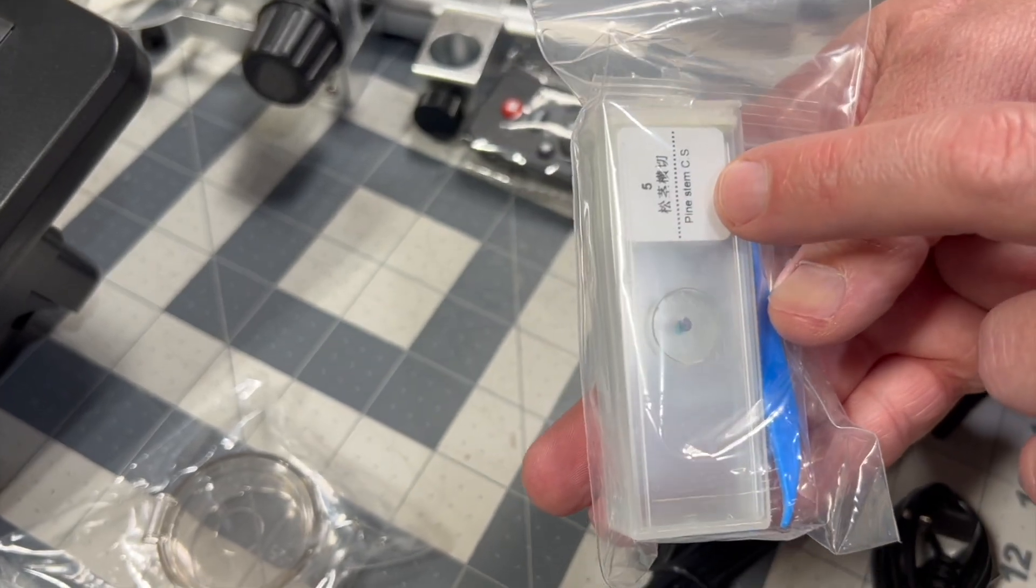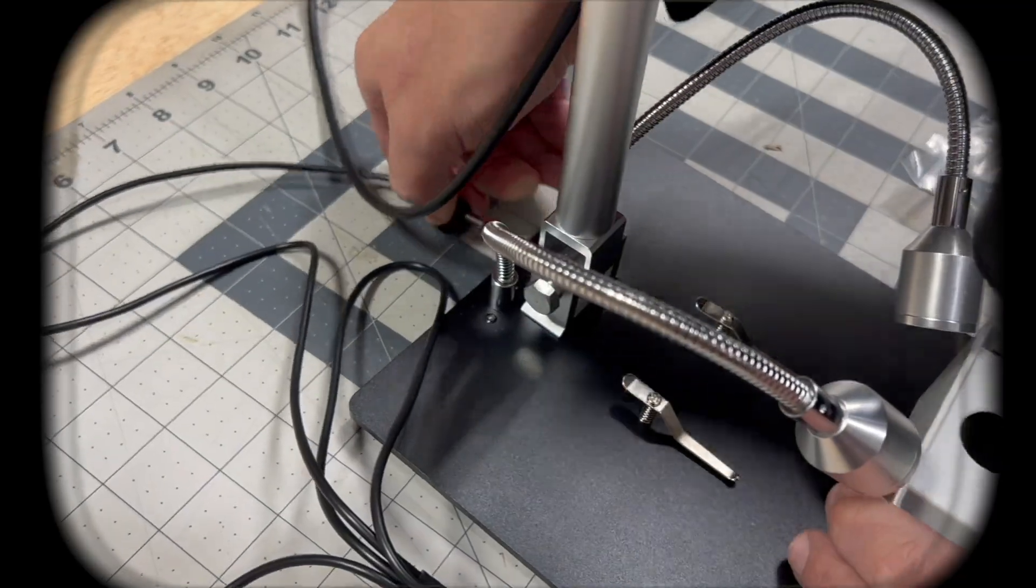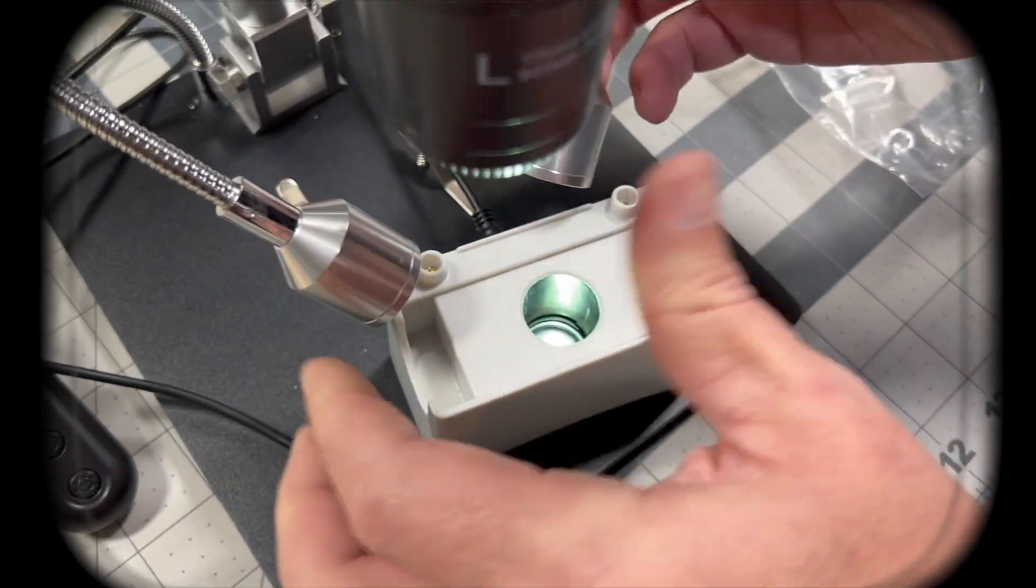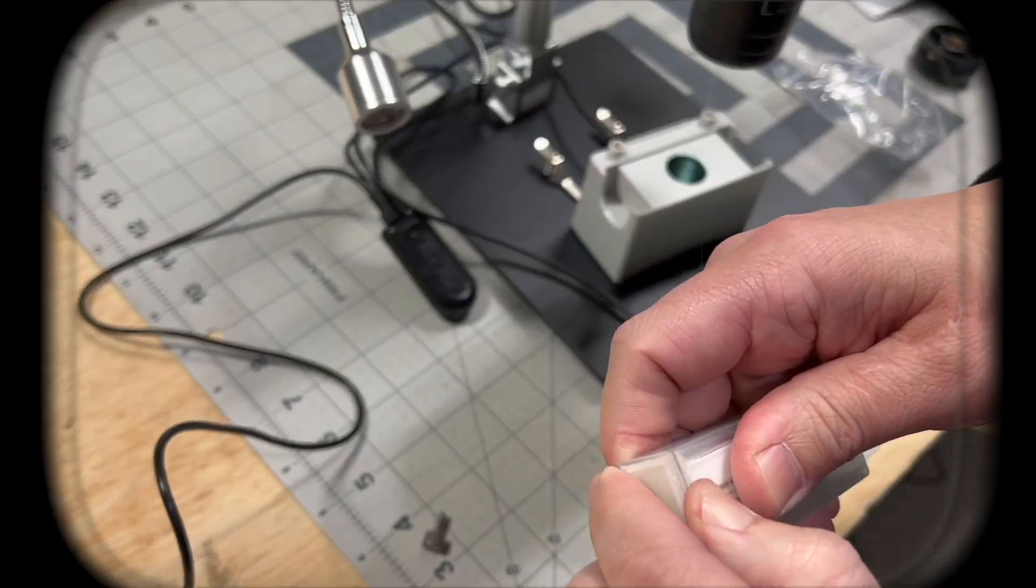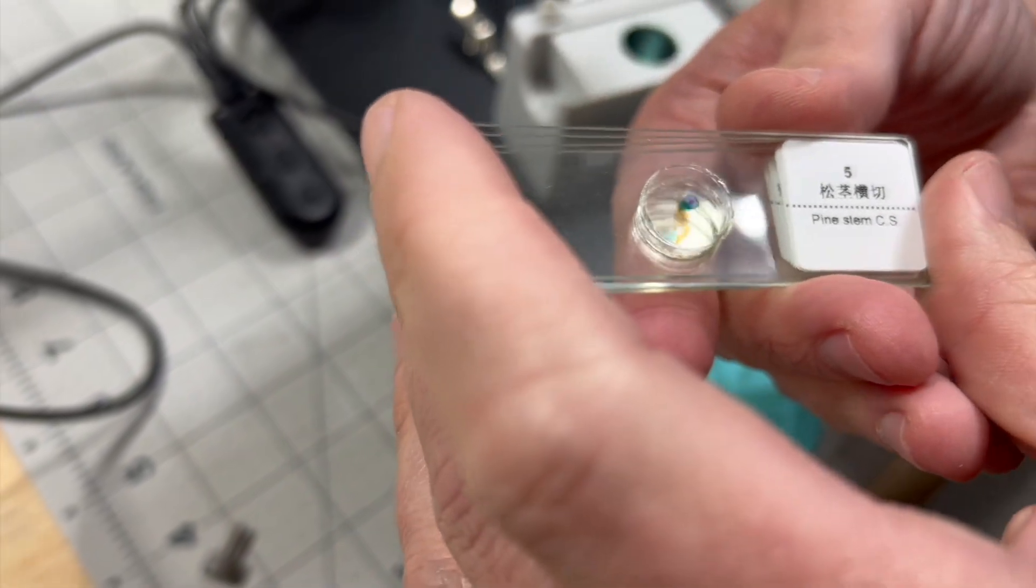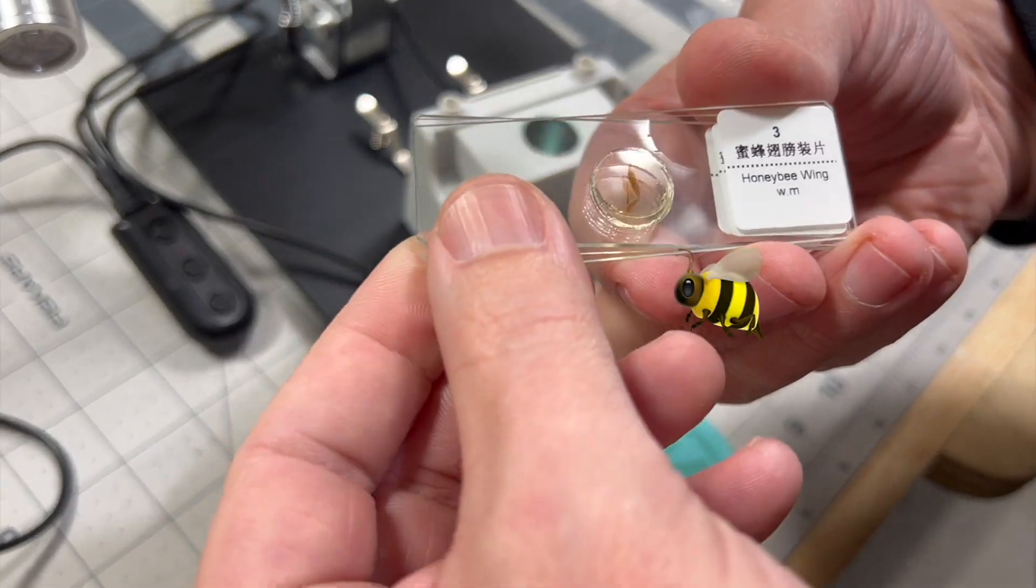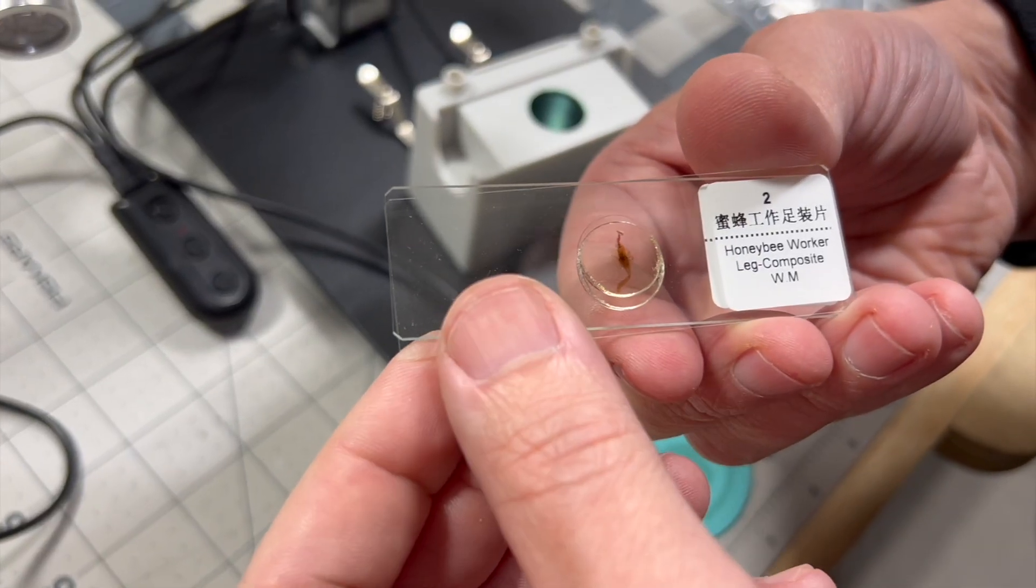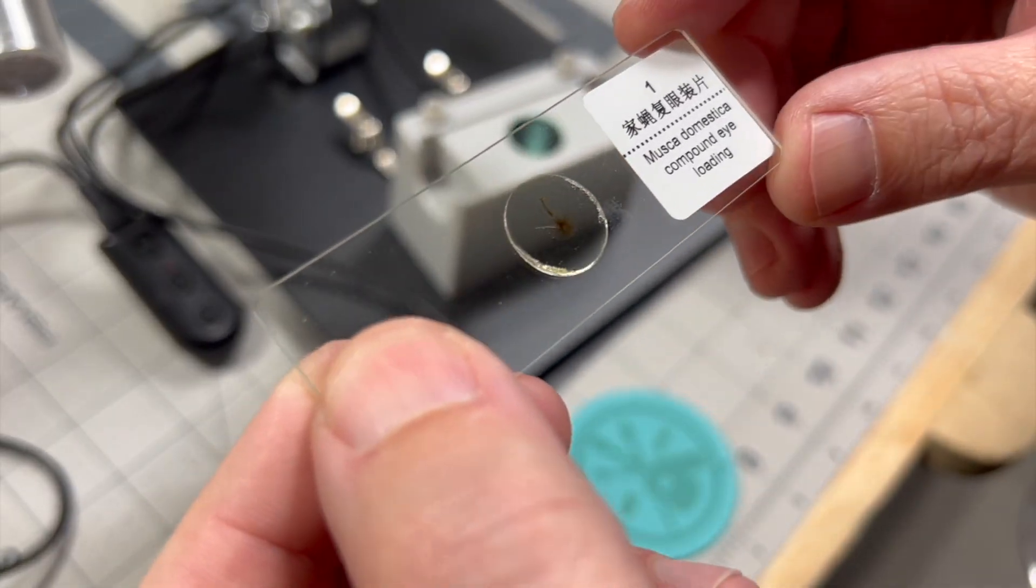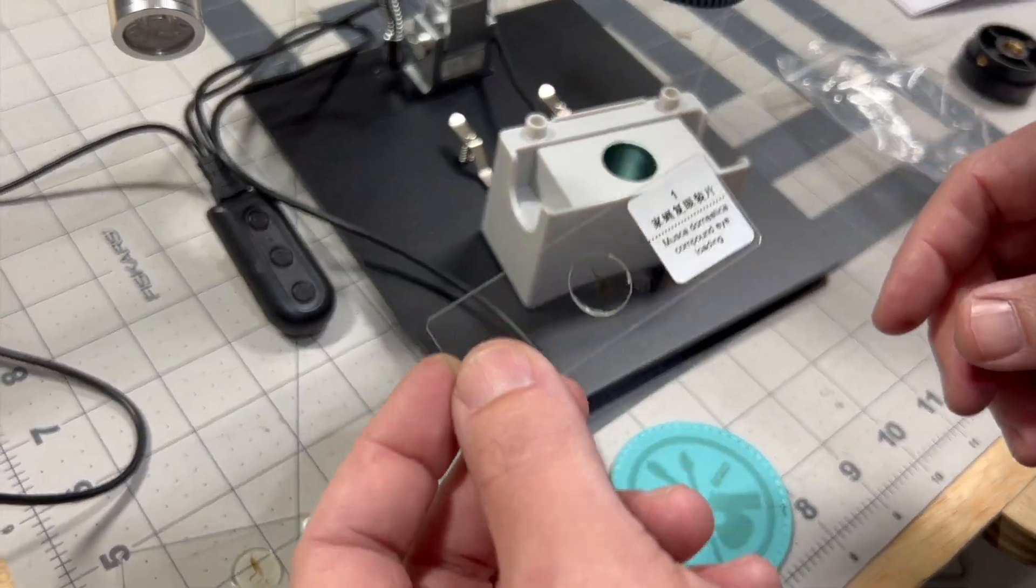Now let's look at some of those cool slides that it came with for the slide box. This is going to be our light source. Let's see what we got. What comes with this thing? So we got pine stem, epidermis of onion, interesting. Oh, honey bee wing, a honey bee worker leg and compound eye. I'm not sure what that is. Well, let's see.